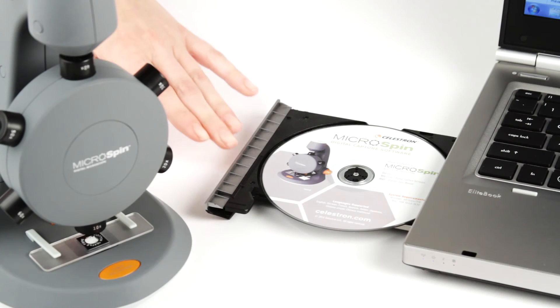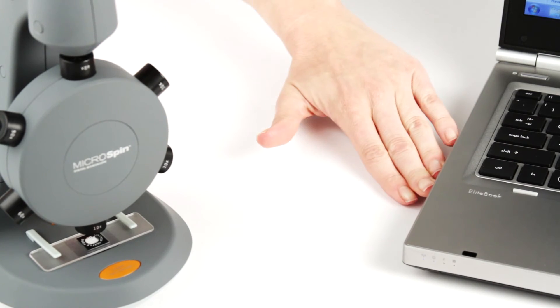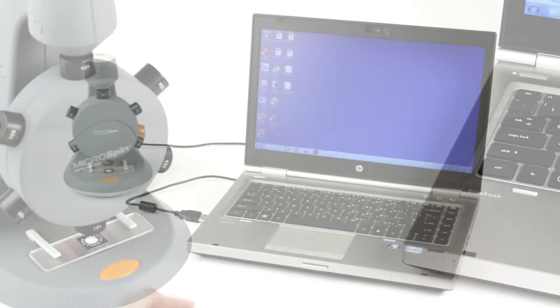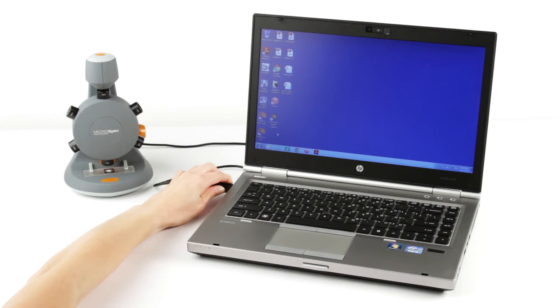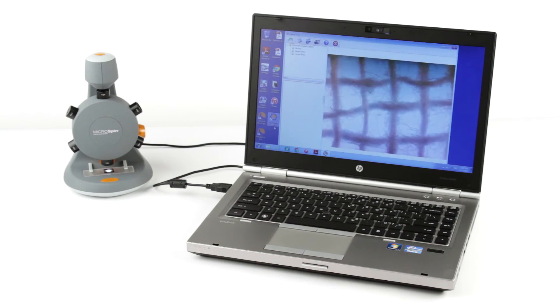Microspin works with your Mac or Windows PC using the provided Microspin digital capture software. Plug the microscope into your computer's USB port and view a live feed on your screen.